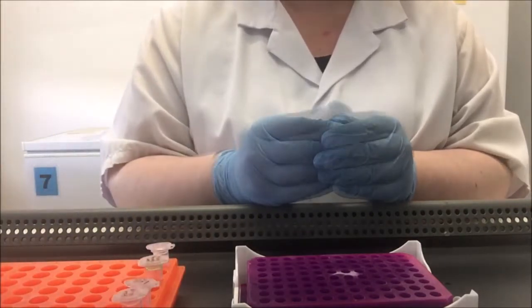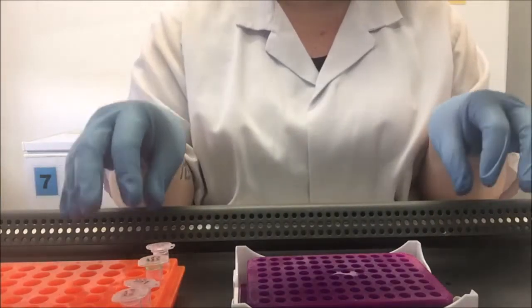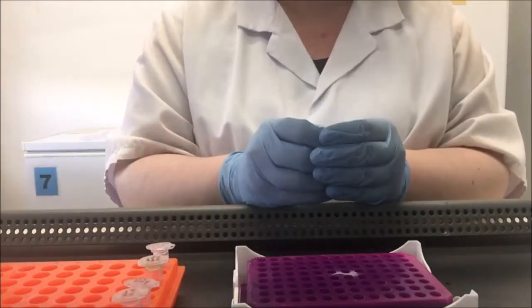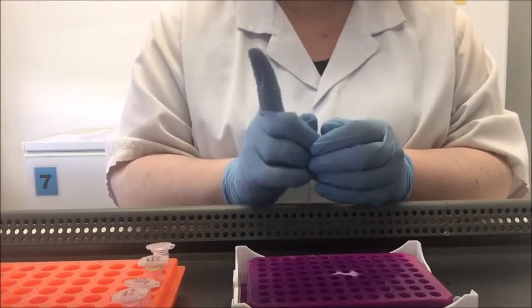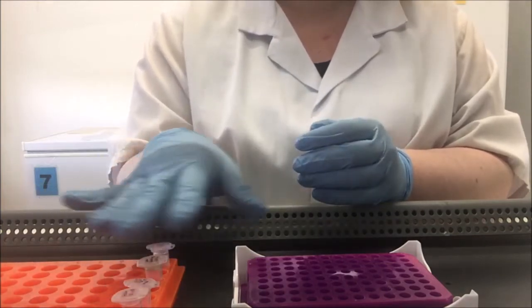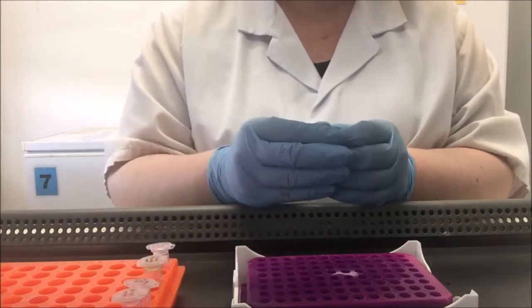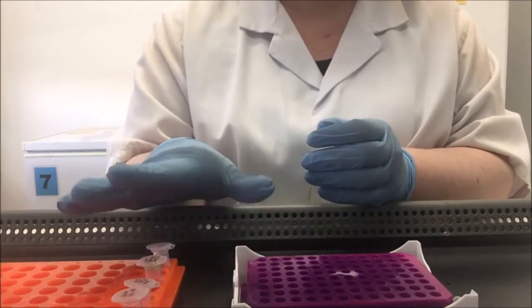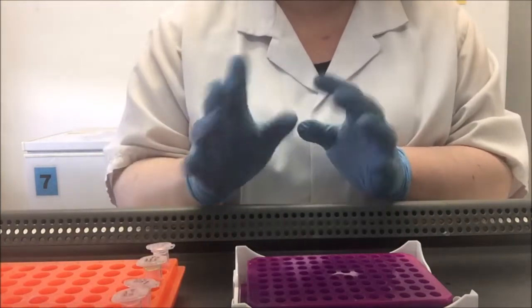This allows us to reduce the number of reagents or separate tubes that we use to go into our mix. So it reduces potential sources of contamination and reduces labour. But by having something premixed like this, we also reduce our options for tailoring our mix to suit our purposes. So much like instant cake mix, it has some pros for convenience and some cons for versatility.